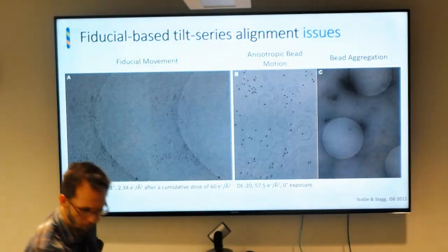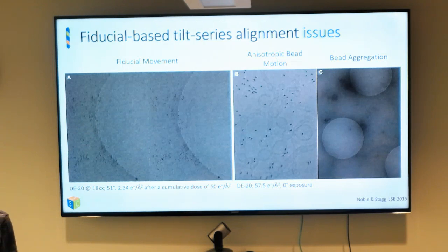Historically, people have used these gold beads for tomography forever. Recently, have they reprocessed data with these gold beads in it? Can you track on just the sample itself, excluding the gold beads? So subtracting gold beads from your images is what you're saying?